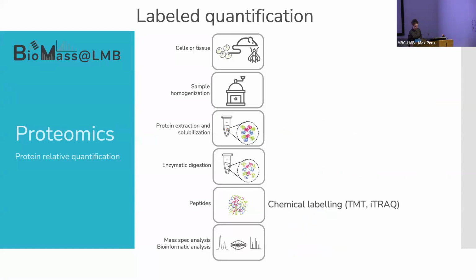In TMT, again, TMT is an alternative for everything else that's not in cell culture. There's also another caveat. There's a limited number of labels that you can use in SILAC. So you can multiplex 3, 4 maybe. That's not a lot. There's not a higher degree of multiplexing.